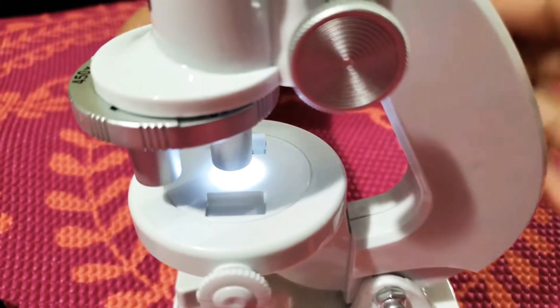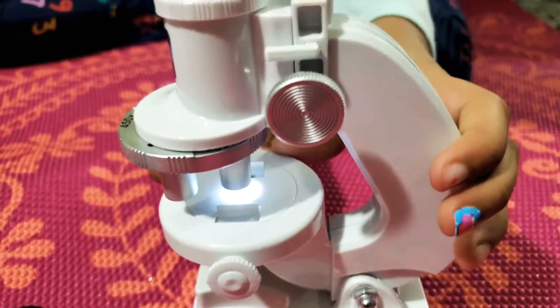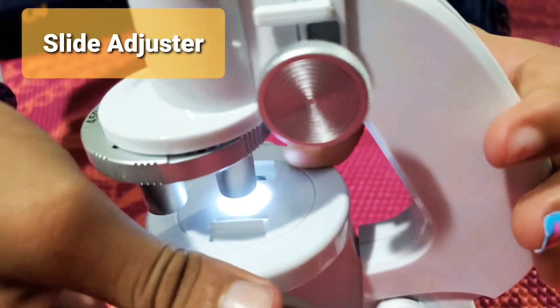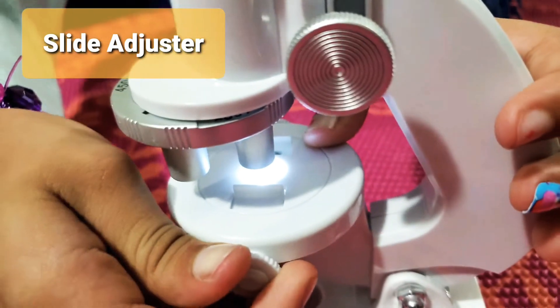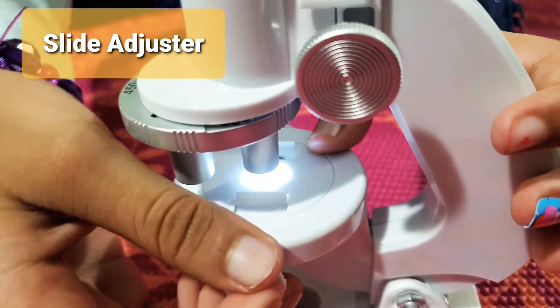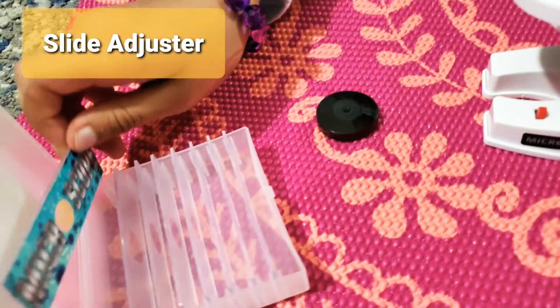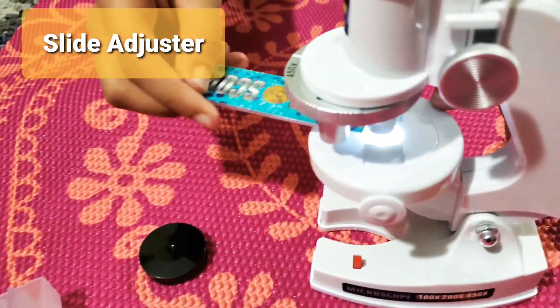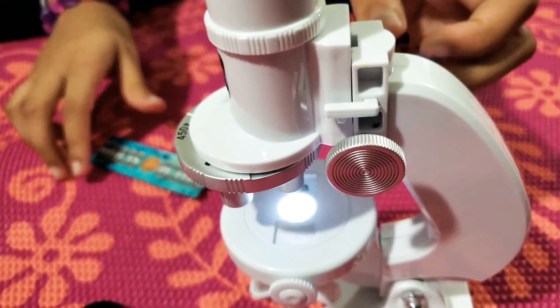There is also a slide adjustment. It is for the slide we have — we can fit it in here so we can see what is in it. Let's put the slide in and see what is in it. Let's first get this up — there you go.